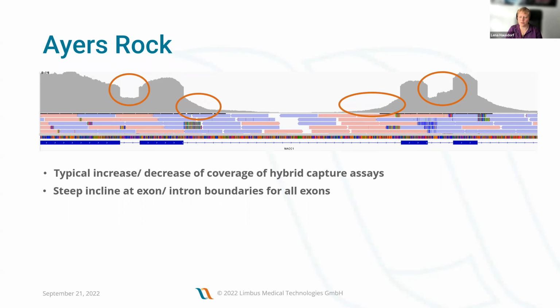assay. It's just an example for me, because it's not an amplicon-based assay. It just looks like one, you know. So I hope that made it a little bit clearer to you.